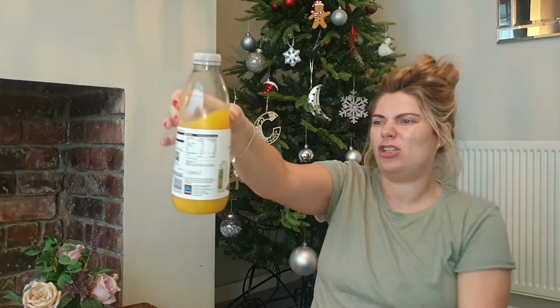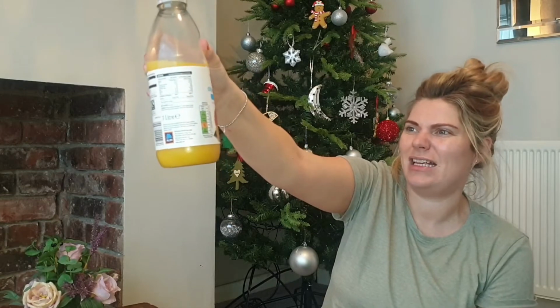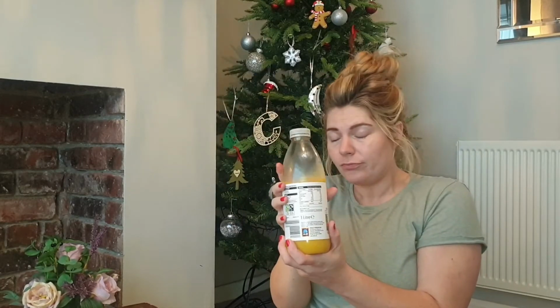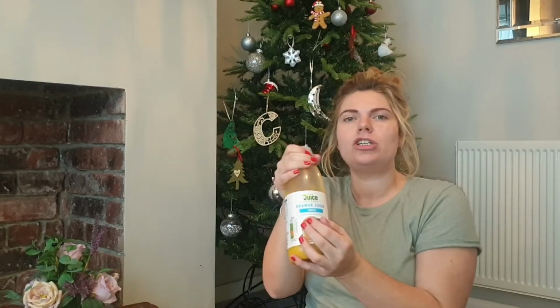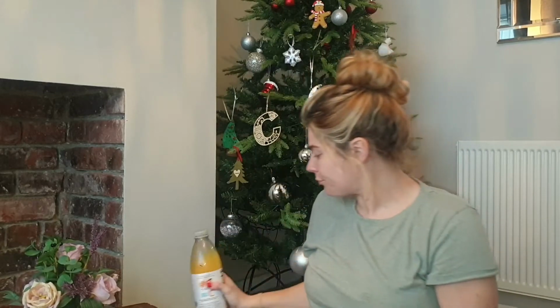I think this orange juice looks a yellow-orange colour, but because we call it orange juice, we naturally think it's orange. I'm going to link a video below of somebody actually doing the flame test, as I don't have a Bunsen burner or anything at home. So sodium is orange-yellow and they will accept either colour.